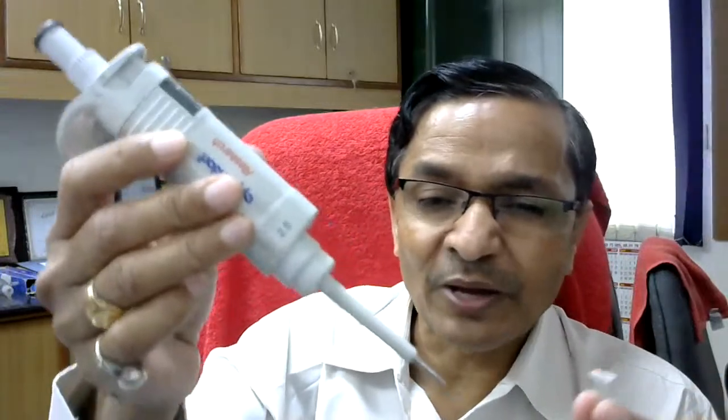Otherwise, if you have to add something, like when you are making PCR mix, then you have to use pipettes. So I was showing pipettes last time. Using these pipettes, you will be adding solution here. Maybe 1.5 microliter, maybe 2 microliter, 5 microliter, 10 microliter, or something like that.